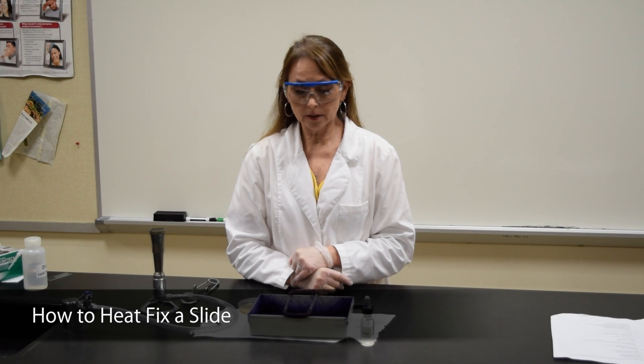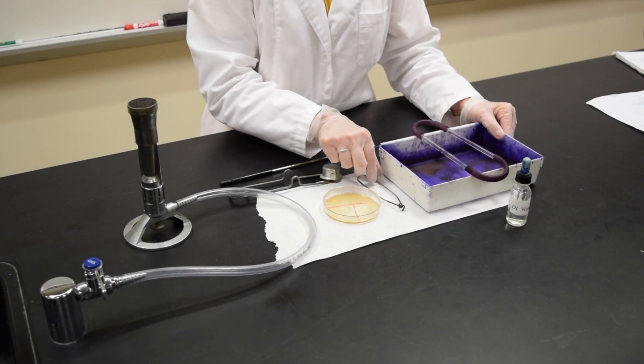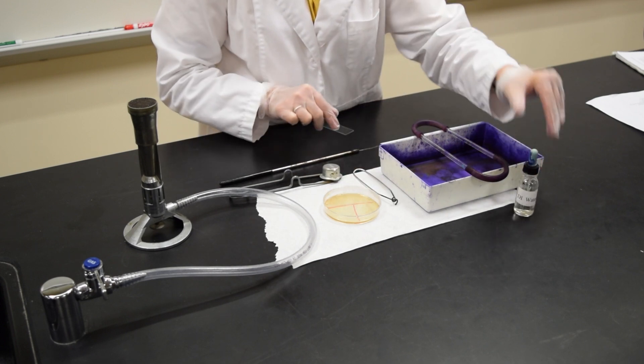This demonstration is how to heat fix a slide. Your gloves and goggles should be on. You will need your staining tray and rack. You also will need from your drawer a slide holder as well as a bottle of deionized water.